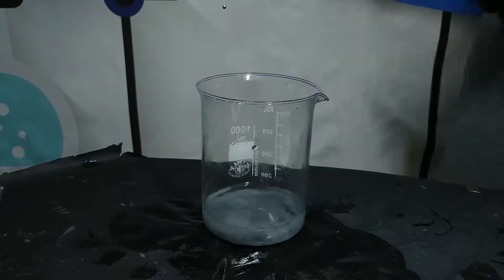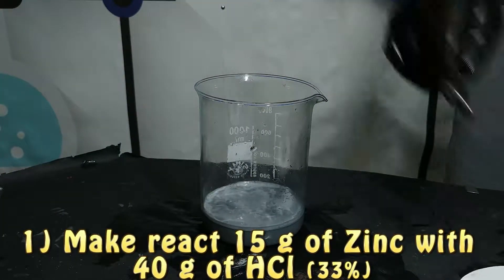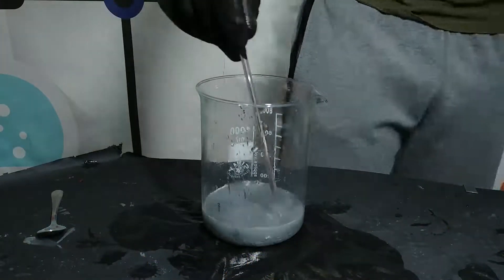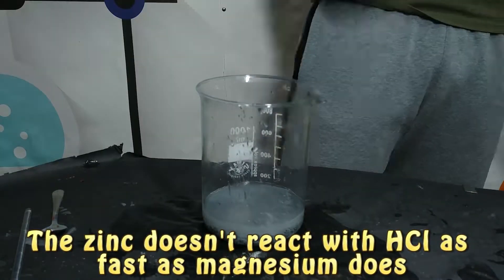The third part of this experiment is going to make zinc ions react with aluminium foil. Since we have zinc in powder form, we need to transform it into ionic form. To do that, we are going to make zinc react with hydrochloric acid, just as we did with magnesium. This time it will be a little more difficult because zinc doesn't react as readily.